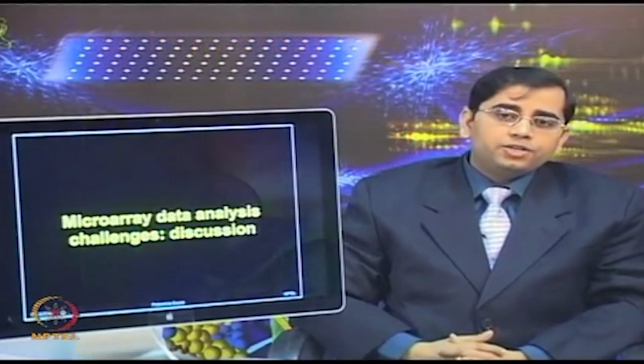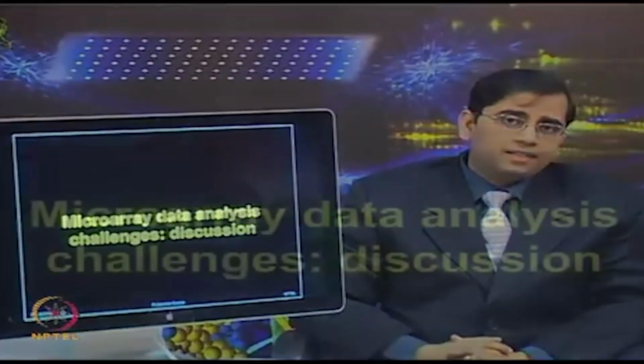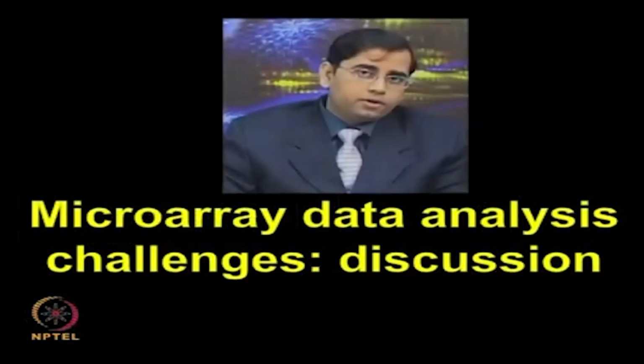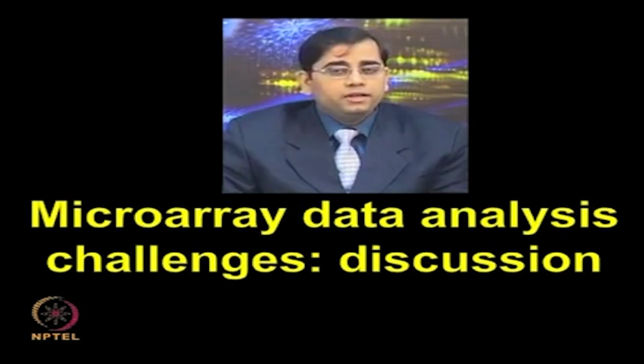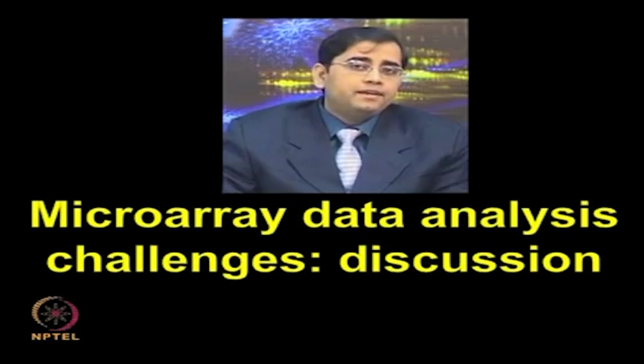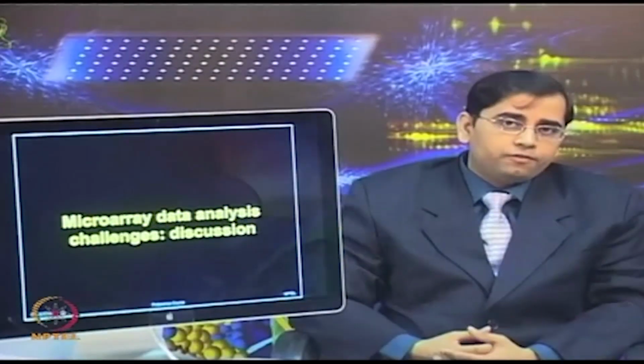So, let us have a discussion with Dr. Sudhesh Srivastava on microarray data analysis, what are the challenges involved, and then in subsequent lectures we will talk in more detail about different steps and nitty-gritties which one needs to follow for data analysis of microarray based systems.